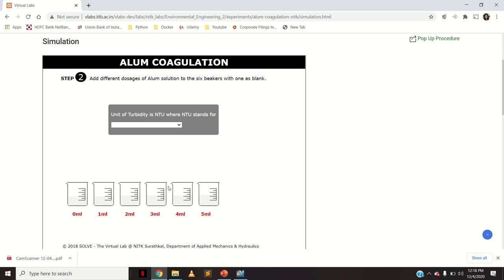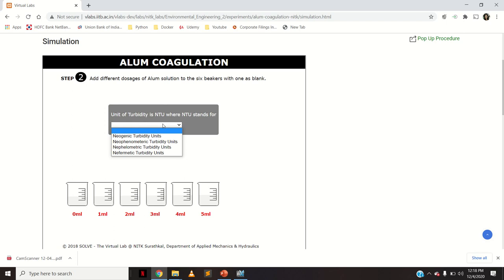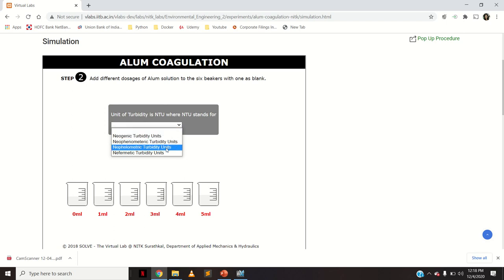Alum exists in crystal form as well as solution form. You can add it in crystal form but it takes a long time to mix properly. The alum solution gets properly mixed into the water sample and that is why the alum dosage is taken in solution form. The unit of turbidity is NTU, where NTU stands for nephelometric turbidity unit, because a nephilometer is used.